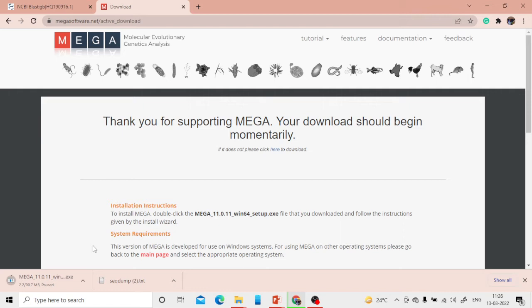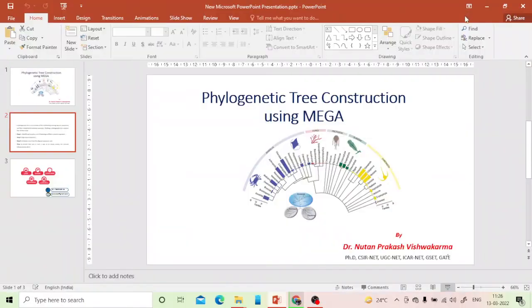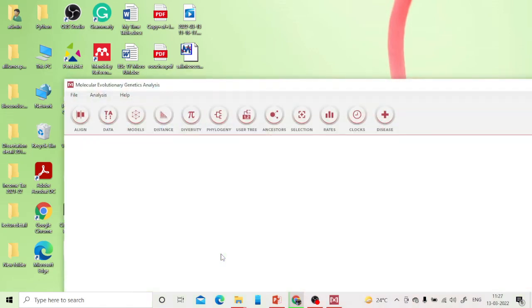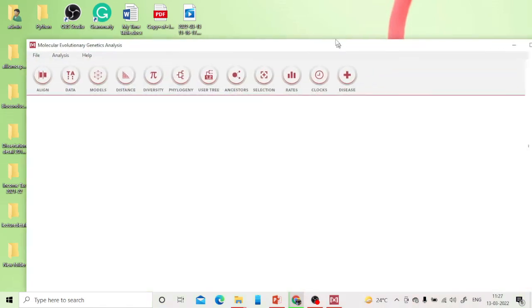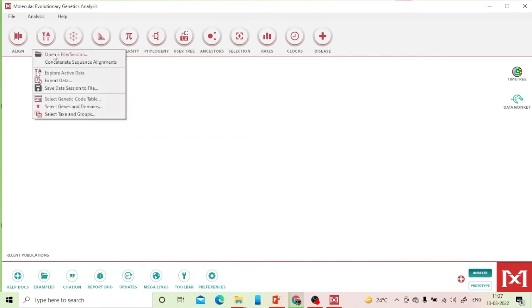There's no difficulty installing it — just like any other software. Since I've already downloaded and installed MEGA, I've skipped that step. Once installed, a desktop shortcut will appear. Let me click on MEGA 11 and wait for it to open. You'll see a very simple interface.